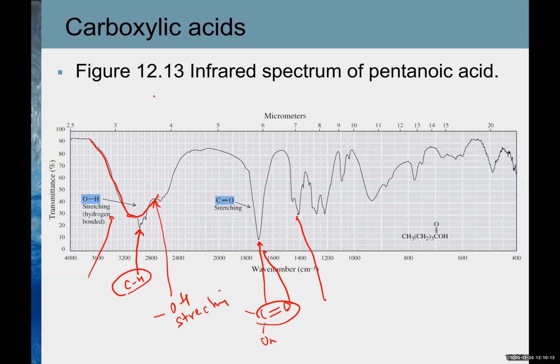How about this one? What is this peak? It's from 1400 to 1450-ish. Anyone? Is that the CH2 bending? Yep. CH2 bending.